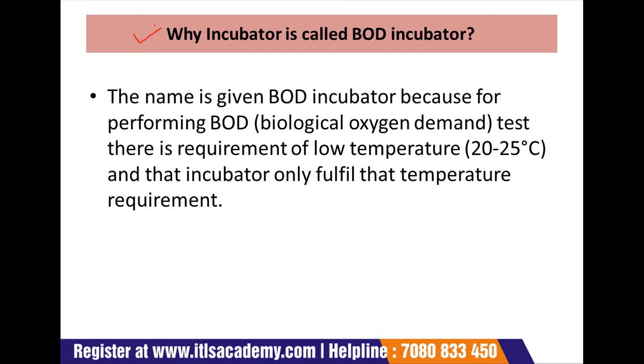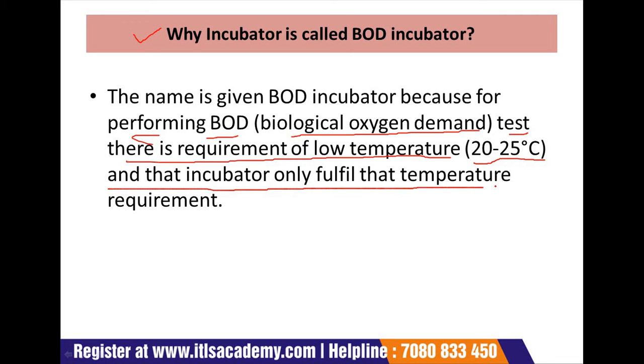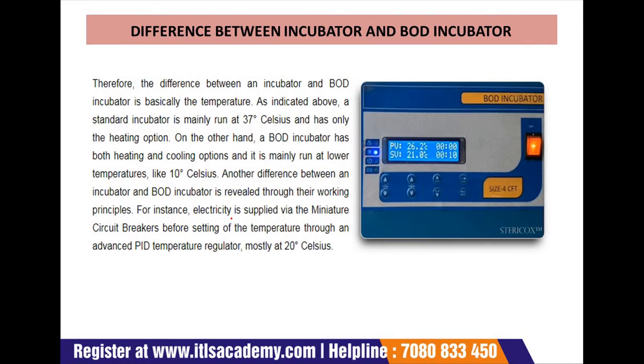The name is given because performing the BOD biological oxygen demand test requires a low temperature, 20 to 25 degrees, and this incubator fulfills that temperature requirement. That's why it is called a BOD incubator.